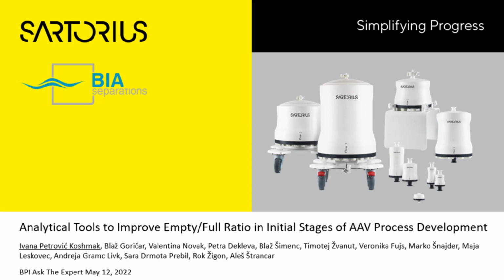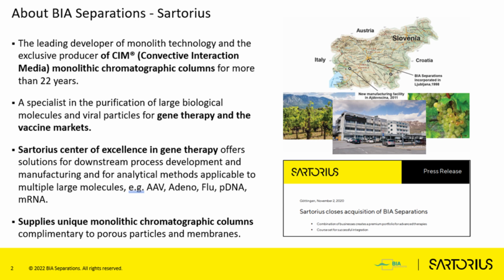Today's topic is going to be the analytical tools to improve empty-full ratio in initial stages of AAV process development. This is the work done by our upstream process development team as well as the analytics team.